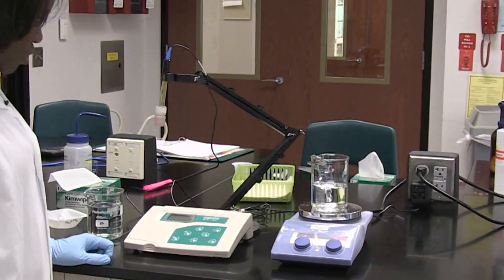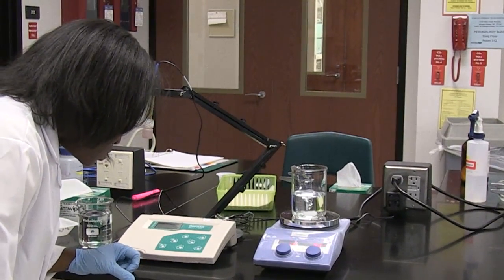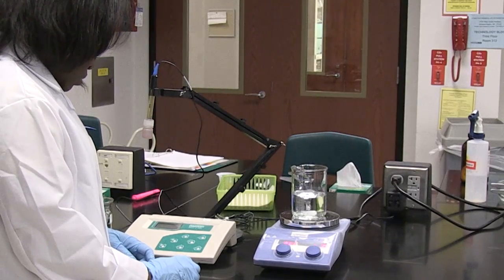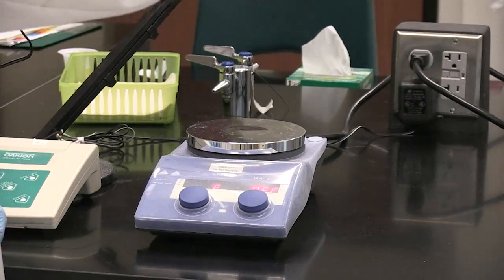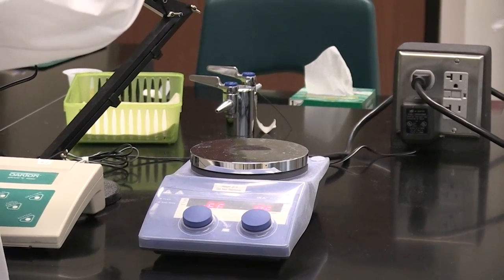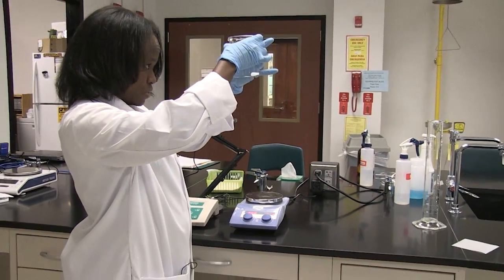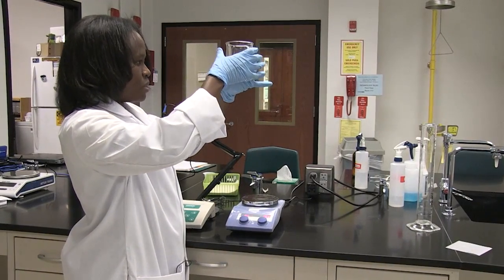The idea here is to make sure that all the solute has dissolved. I'm looking at the mixture and there are still solutes visible, so I'll have to let it continue mixing. Now I look at my solution and I don't see any more solutes, which means they have completely dissolved.